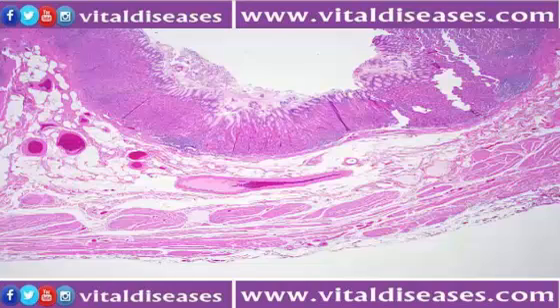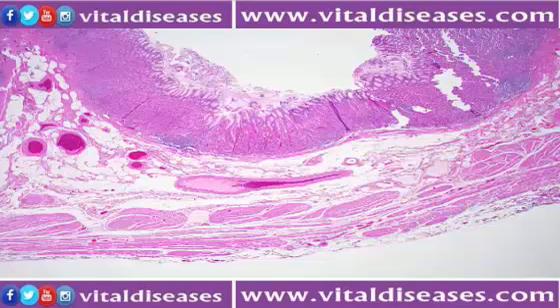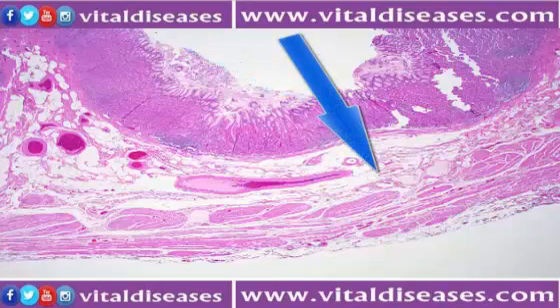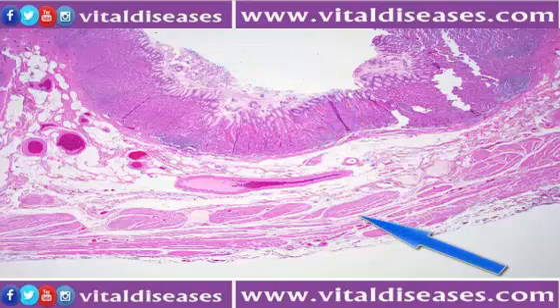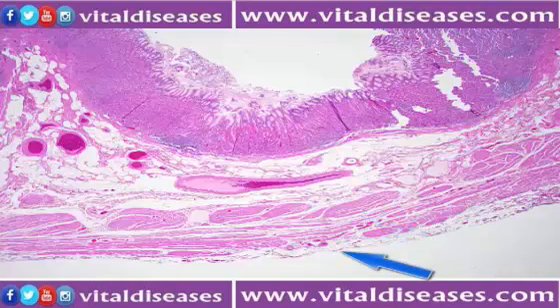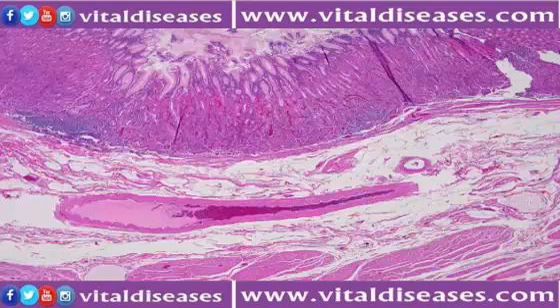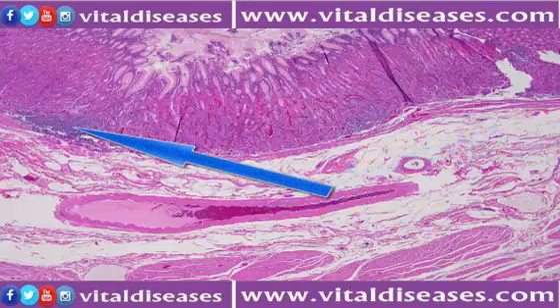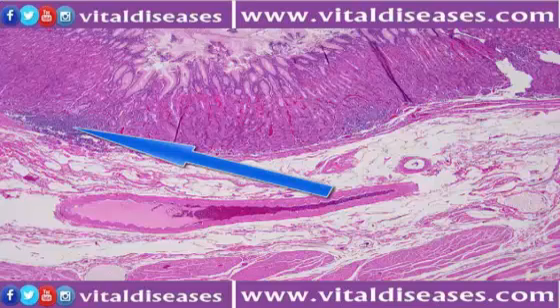The wall of the stomach is made up of 4 distinct layers which serve different purposes and are made up of different cell types. Bordering the lumen is the mucosa, the layer we will focus on. Next is the submucosa, followed by the muscularis externa, and finally the serosa, also known as the adventitia. Here we see a zoomed in view of the previous slide. This is an artery located in the submucosa, and this is lymphatic tissue in the mucosa.